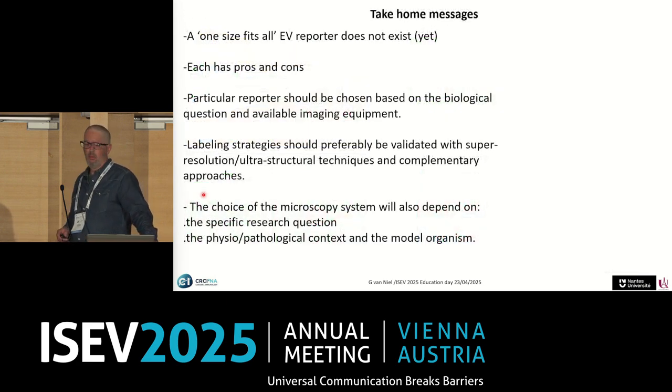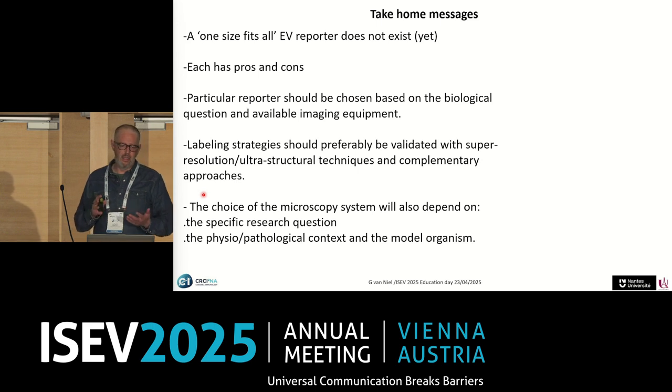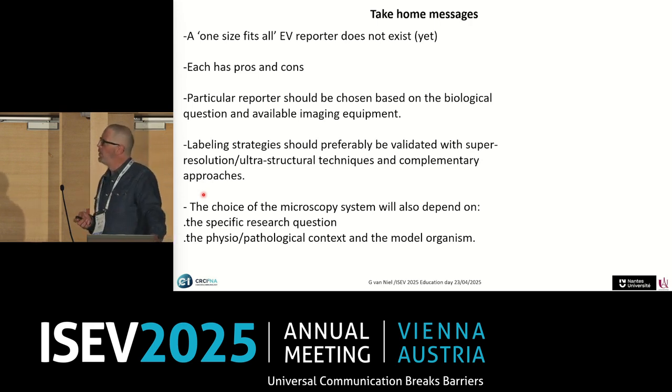So as a take-home message, the first thing is that, again, one size fits all does not exist to report the fate of an EV by imaging. You have to combine everything, the technology, the dye, to better understand what's going on with your EVs. And each imaging technique has pros and cons. A particular reporter should be chosen based on your question.